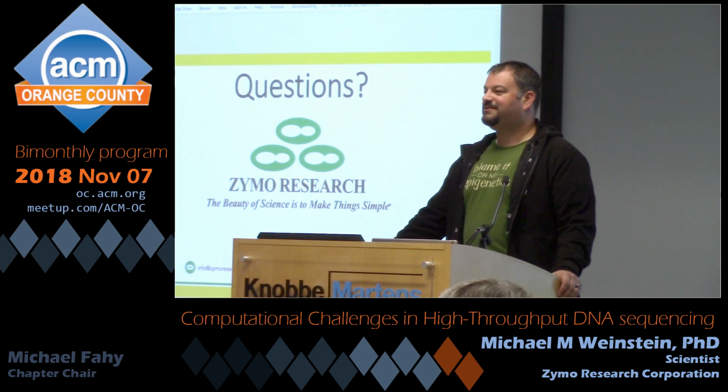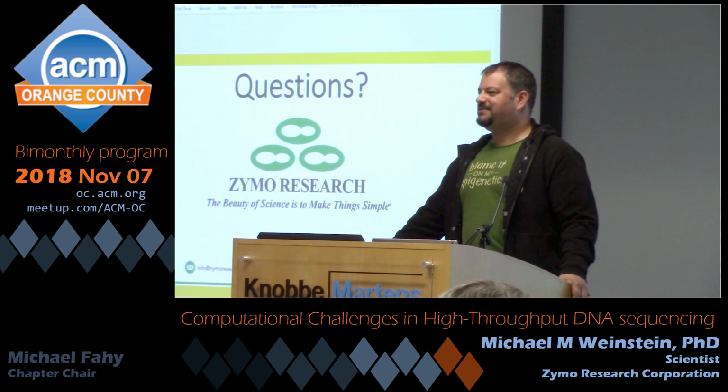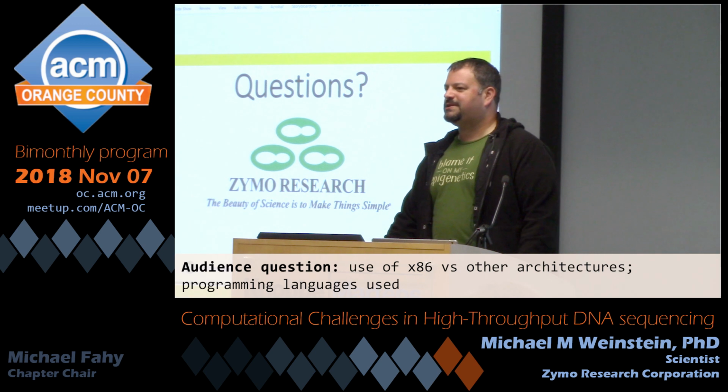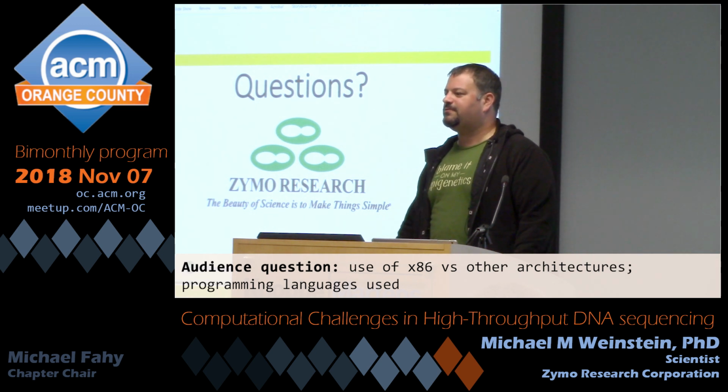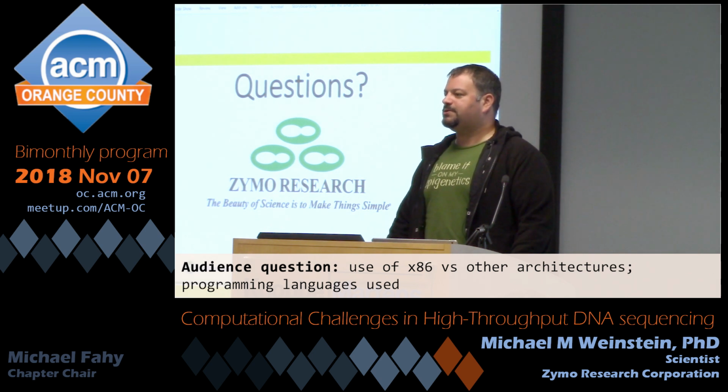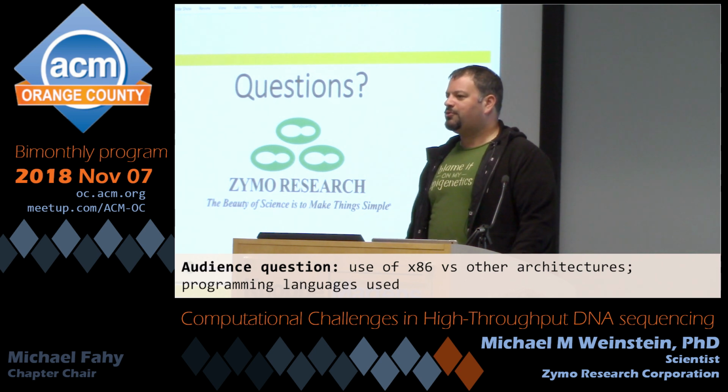So most applications are running on the x86, in general, right? Yeah, a lot of stuff runs on x86, but actually what you'll find is the lingua franca of bioinformatics right now is Python. You'll find some applications that are very high performance that will be written in C or C++, but even there you can run it anywhere, because you'll almost never get a compiled binary. You're typically doing a git pull, getting a makefile, and just running a make build.